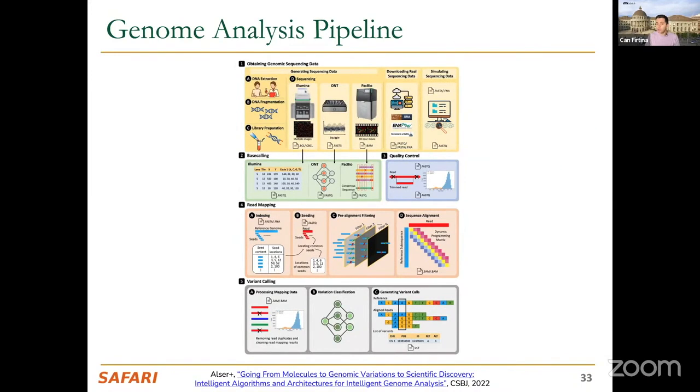We didn't cover PacBio, but it is relatively similar to sequencing by synthesis used in Illumina, but it does the sequencing by attaching a certain enzyme to the DNA strand, and again the free-form bases are attached to the DNA, but this attachment happens not cycle by cycle but in a very continuous way, such that a movie is generated rather than the images that are taken cycle by cycle.